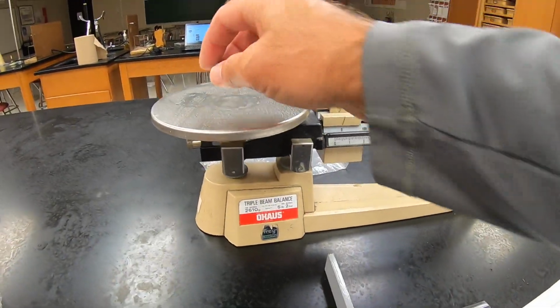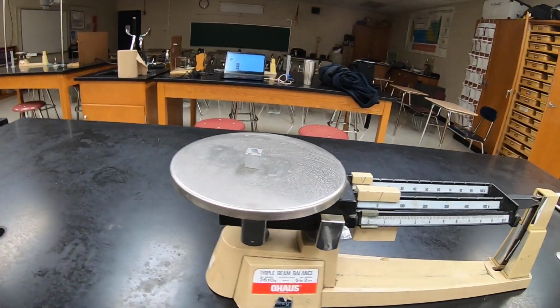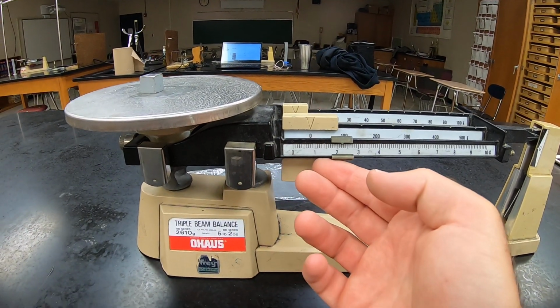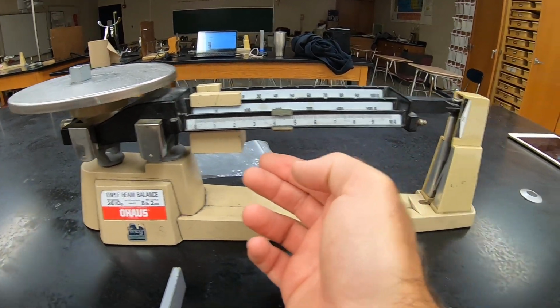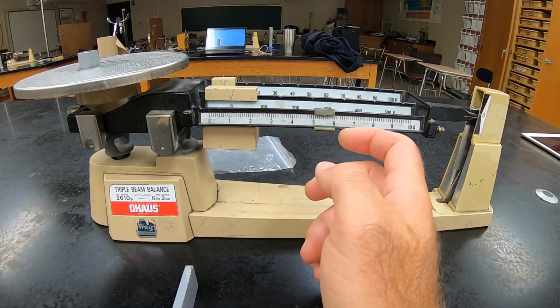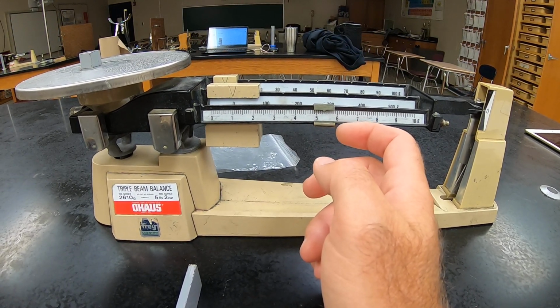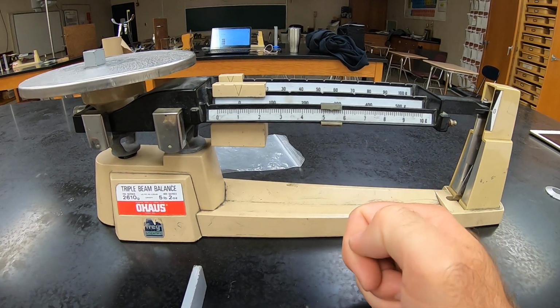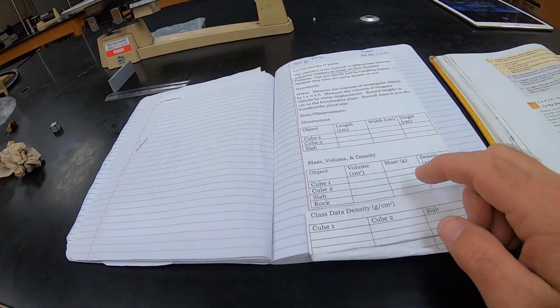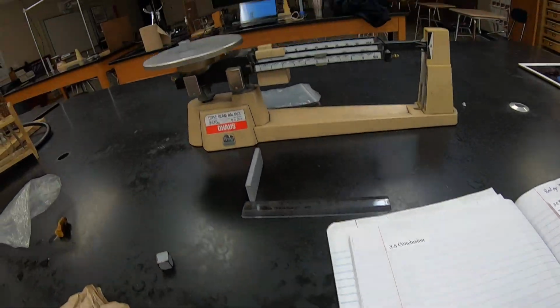Then we'll put cube 2 on and do the same thing. I don't think this is going to be 10, but I was wrong on the last one. Looks to me like it's about 5.35. So cube 2 is 5.35, is what you'll put right here. And then the slab, same thing.